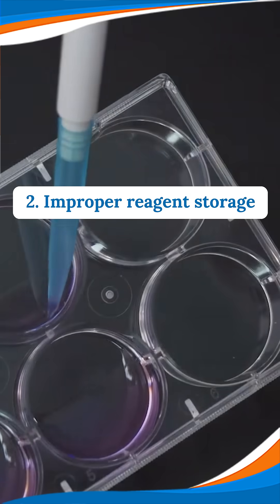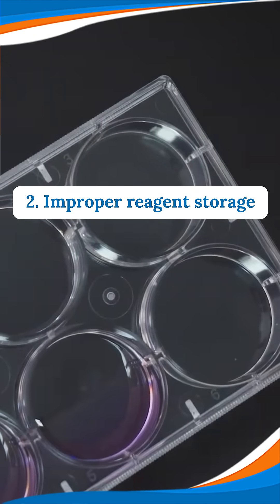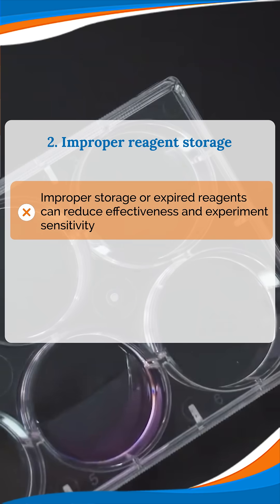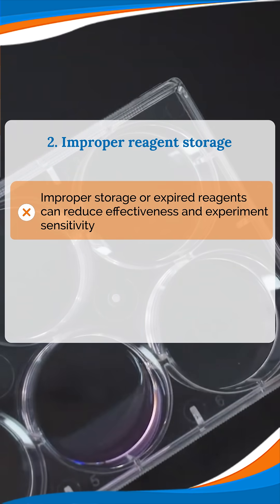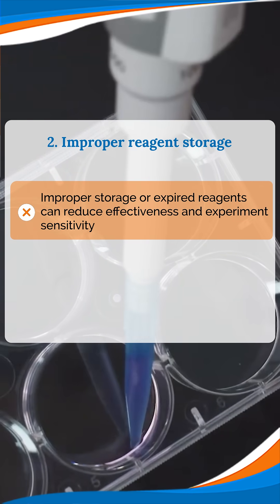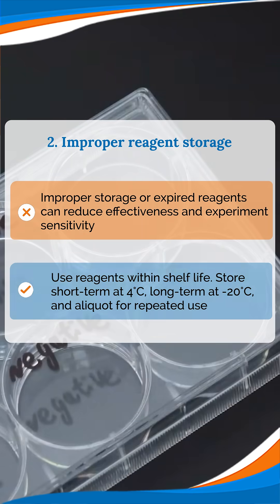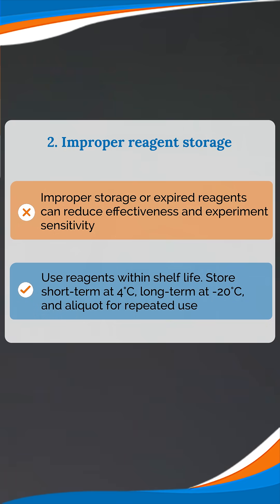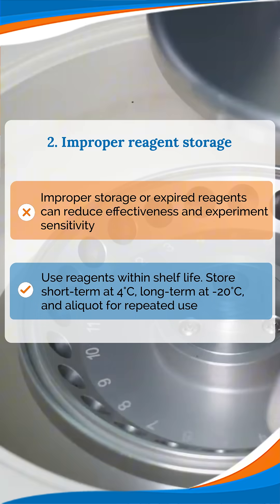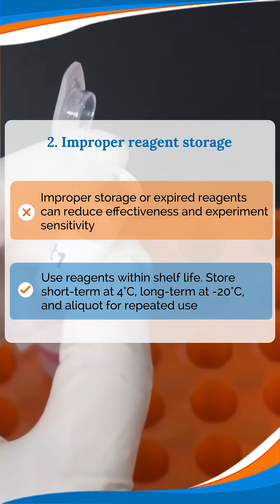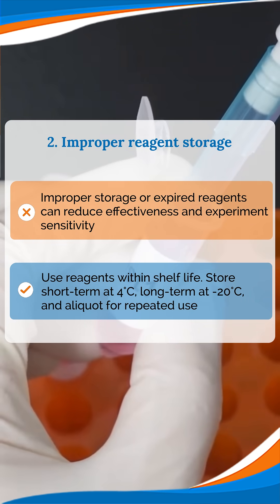Issue 2: Improper Reagent Storage. If stored improperly or past its expiration date, reagents might lose their effectiveness, reducing the sensitivity of the experiment. Tip: Use reagent kits within their shelf life. Store short-term at 4 degrees Celsius and long-term at minus 20 degrees Celsius. For repeated use, consider aliquoting them.